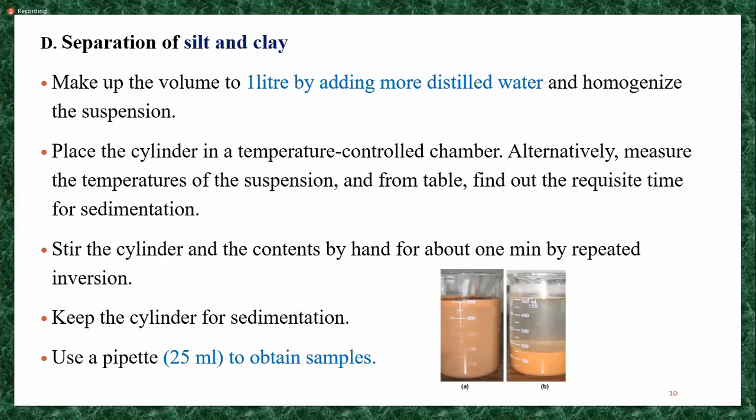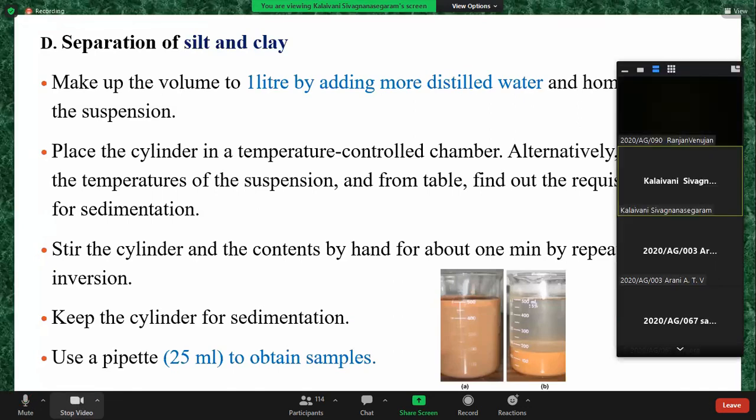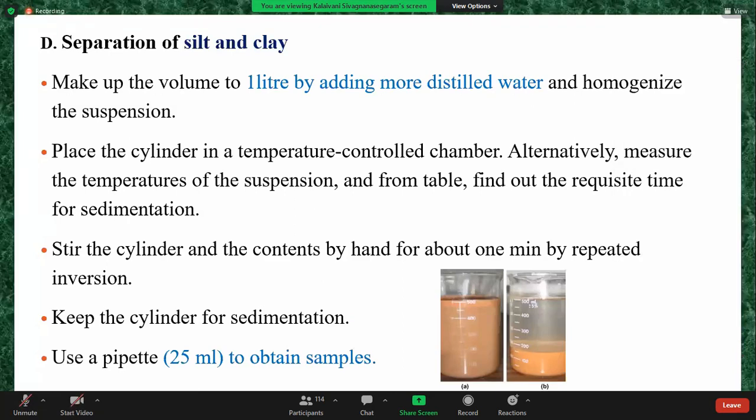So did you understand this procedure? Yes. Okay. So we are giving time for the sedimentation. Can you tell the settling time for silt?